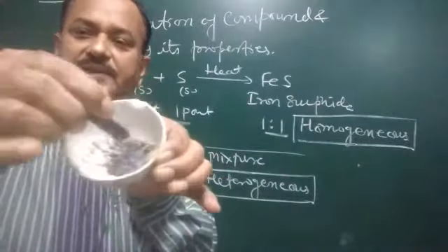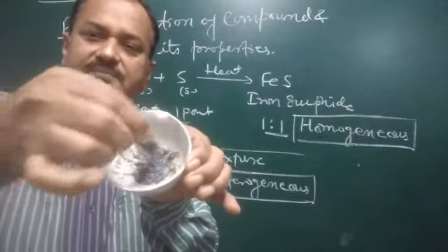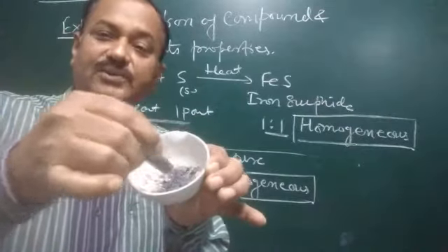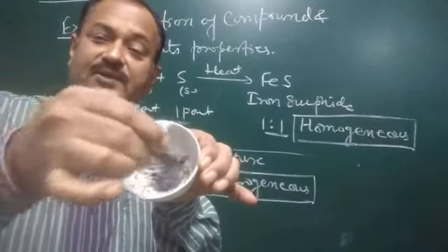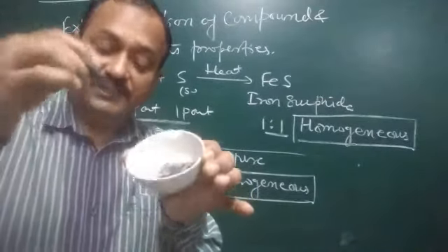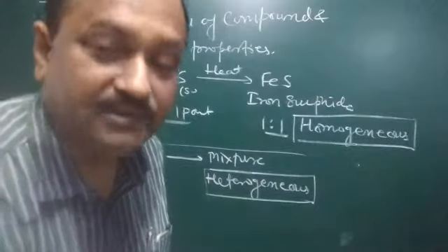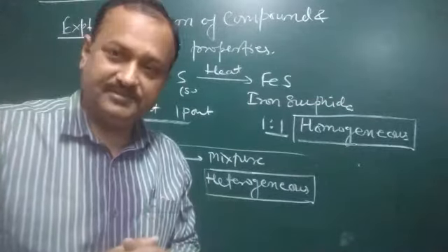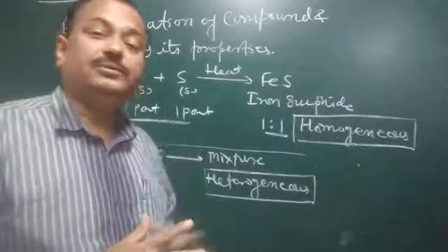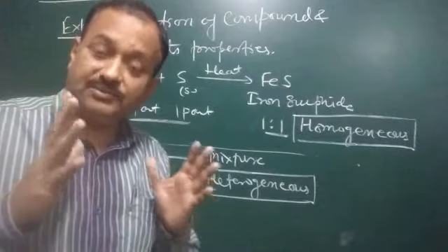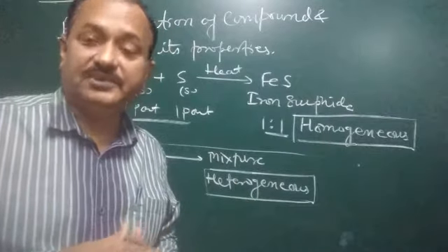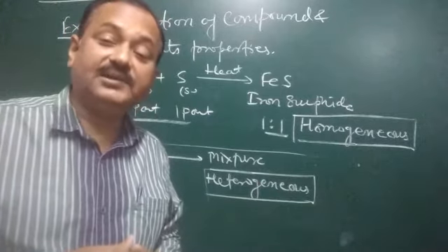When I mix together and move the magnet over the compound, it is not able to attract — it is not being attracted. Because the iron has been converted into a compound, and in a compound the properties are changed. As a result, we say that the compound cannot be separated into its components easily, unlike the mixture where components can be separated. So this is about the formation of a compound and its comparison with the mixture.